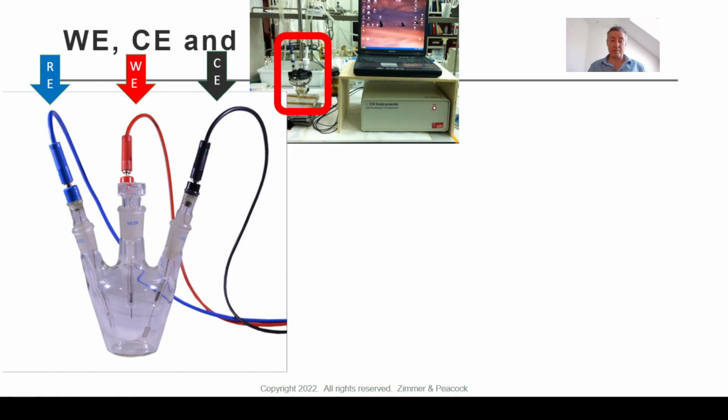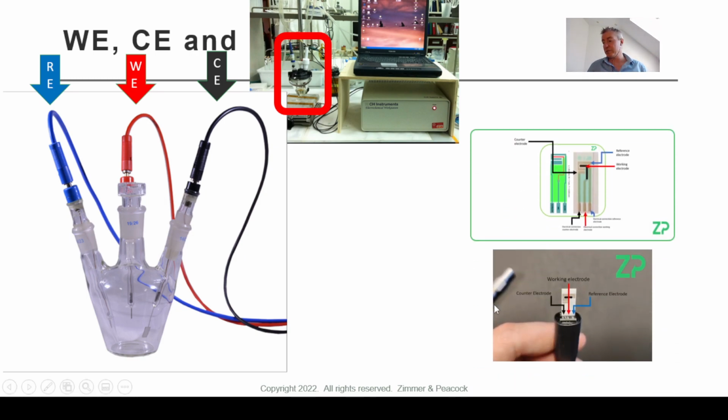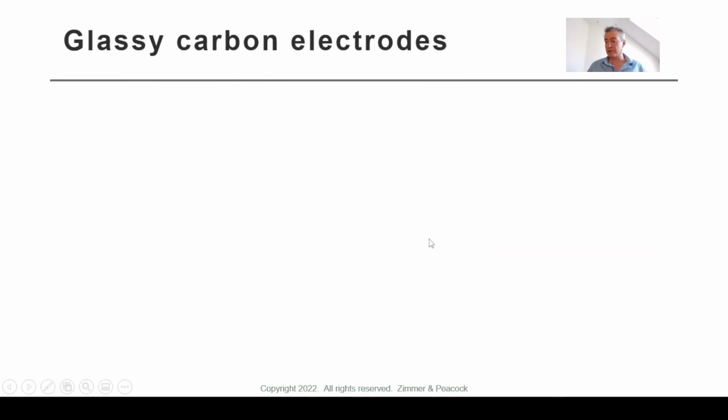And we do use the same protocol, and we try to be consistent with that with our cables as well. Whenever you look at our screen printed electrodes, and I've noticed that a lot of manufacturers do the same, we have a certain sequence of our reference electrode, our working electrode, and our counter electrode, and I know that other manufacturers also keep to the same color code and the same sequence of electrodes as well.